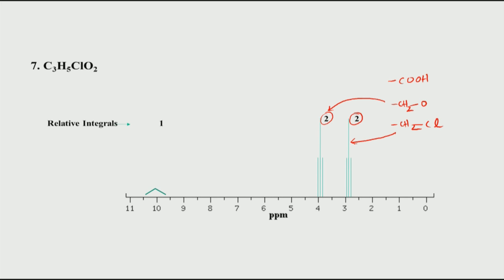But there are 2 oxygens here, and 2 hydrogens, so that cannot be; this possibility is ruled out, because we have already taken care of these 2 hydrogens. So what could be the structure that will satisfy this? It will have to be something like a branched chain situation.